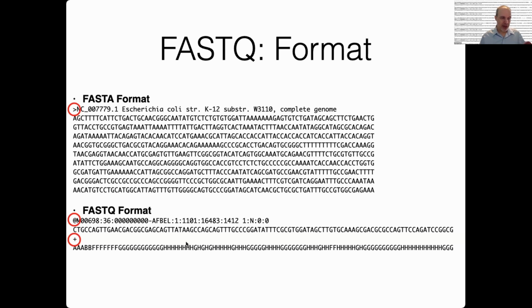I will just mention, because this is a common mistake that people make if they know a little bit about FASTQ files and they know a little bit about programming. They think, oh, well, I know how to parse a FASTQ file. I just need to look for the @ signs and the plus signs, and I'm good. You are not good if you do that.